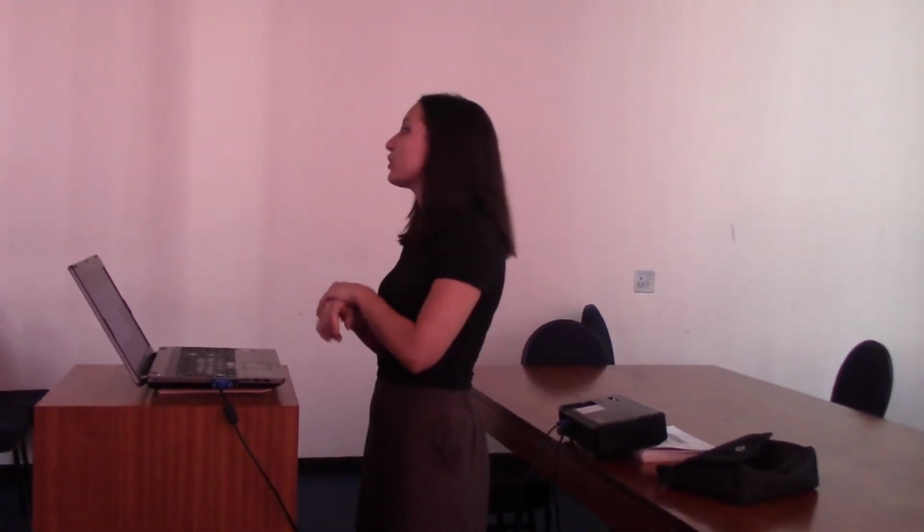So I wanted to describe a basic workflow of RNA-seq, and there are different strategies that you need to employ depending on your tissue type, your cell type, and of course the experiment itself. But basically your first part of the experiment is library preparation. So you're going to do an RNA isolation, very standard RNA isolation. It will change depending on what you're working on. But you're going to do something like DNase treatment. You need to assess the RNA quality, right? So usually we use RIN numbers. Quantify how much RNA you're able to get out.